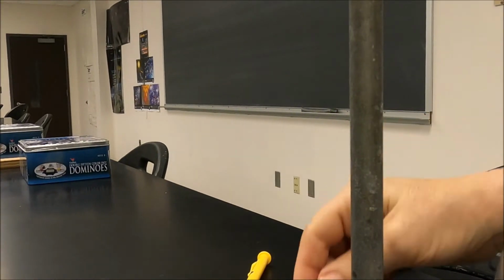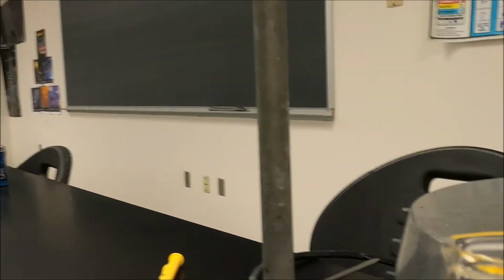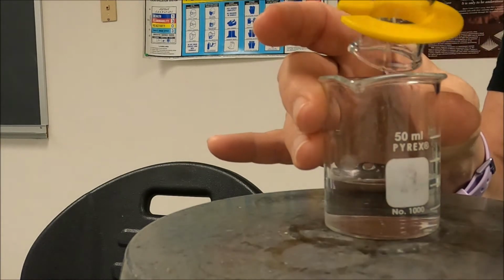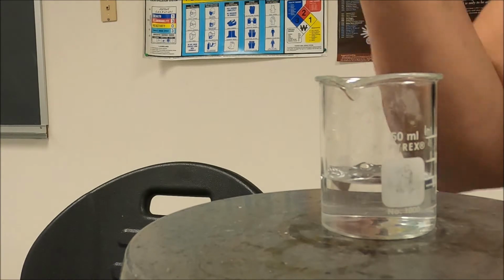Whoops. Well, lab disaster. Sort of. Glassware sometimes breaks, and I managed to break a beaker, but that's okay. There's the water. That one's just straight water.